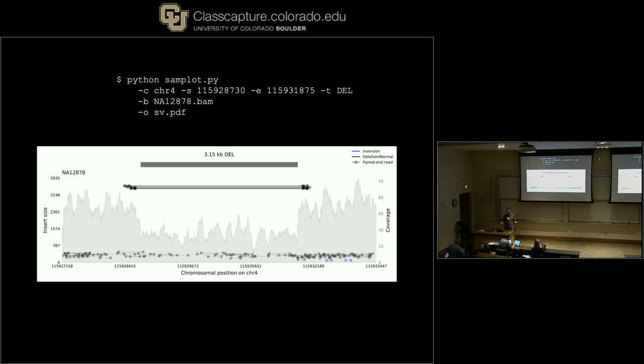This is quite nice because I have 3,000 plus structural variants I want to look at. I don't want to spend an enormous amount of time creating the data and downloading the data. The size of those PNGs is a tiny fraction of the total BAM size and also much faster. So let me walk you through this plot really quickly. Along the x-axis you have genomic position.